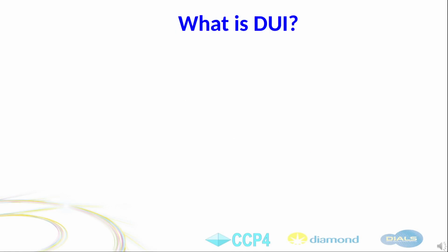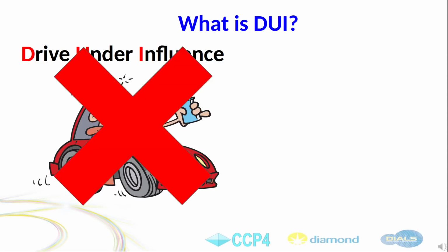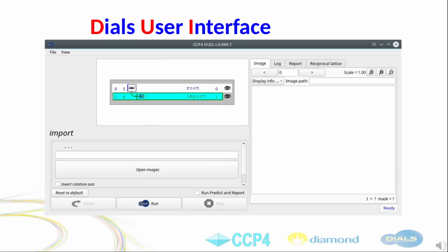So, what is DUI? The acronym, by coincidence, is driving under the influence, like drinking and driving, which is illegal. But no, we are not encouraging that behavior here. This is completely different. This is DIALS user interface, a graphical interface for DIALS. And in this talk, we are going to talk about version 2.